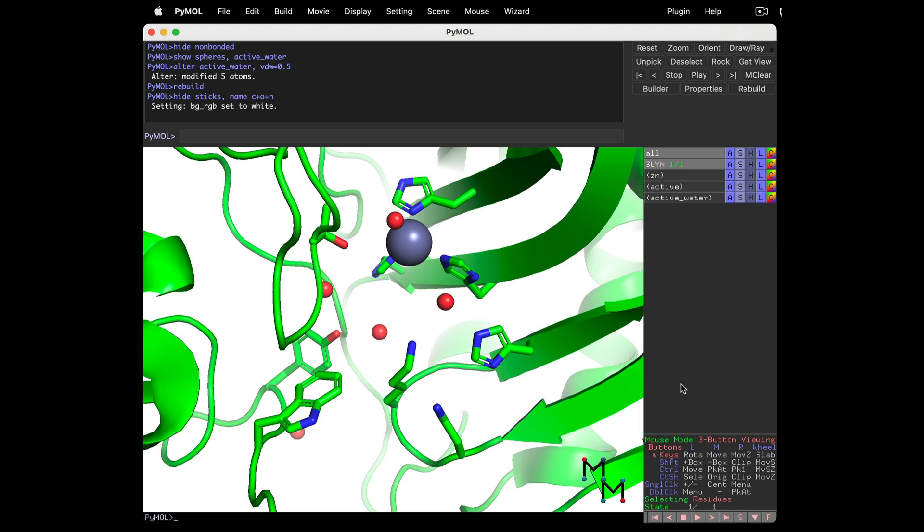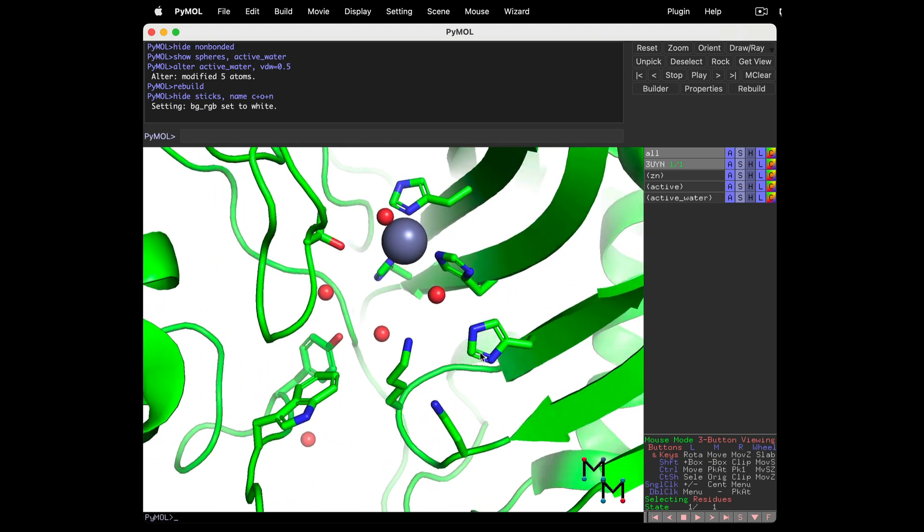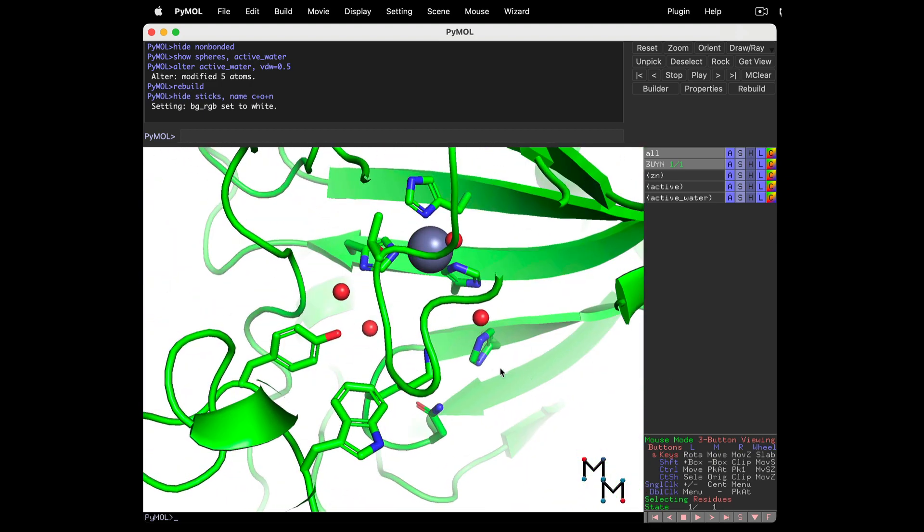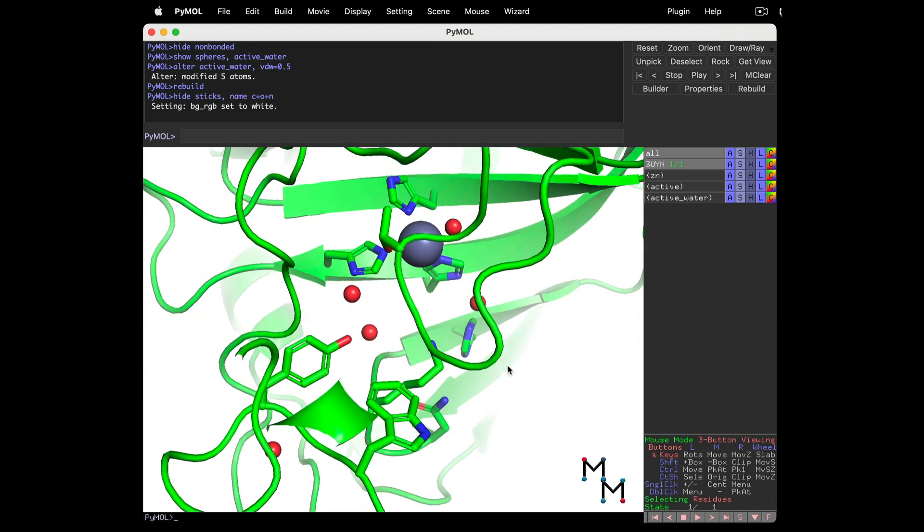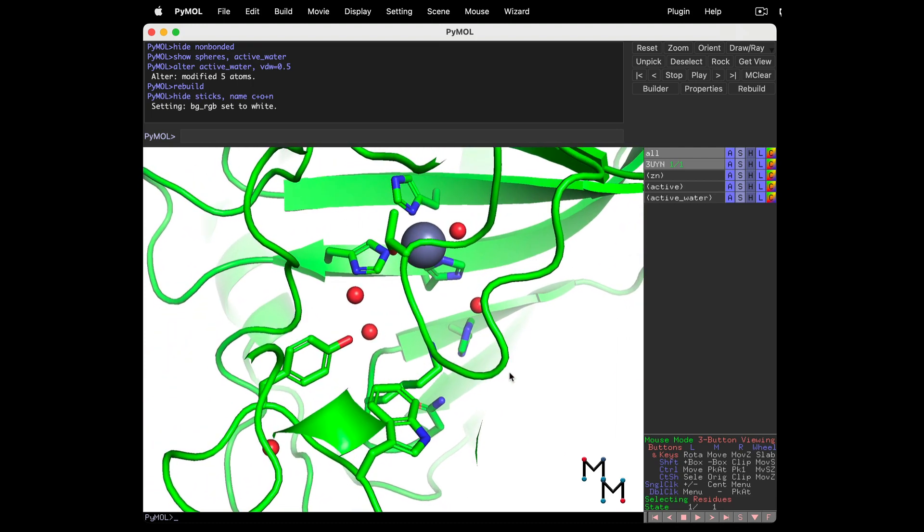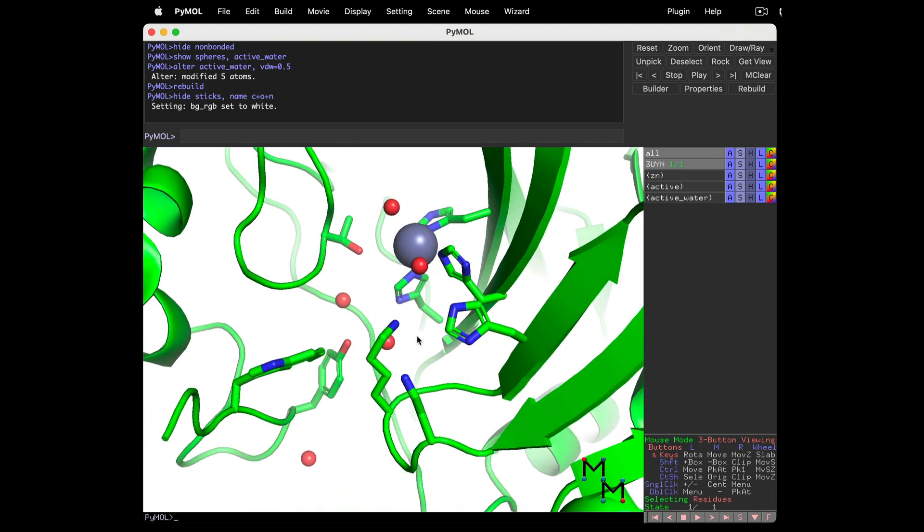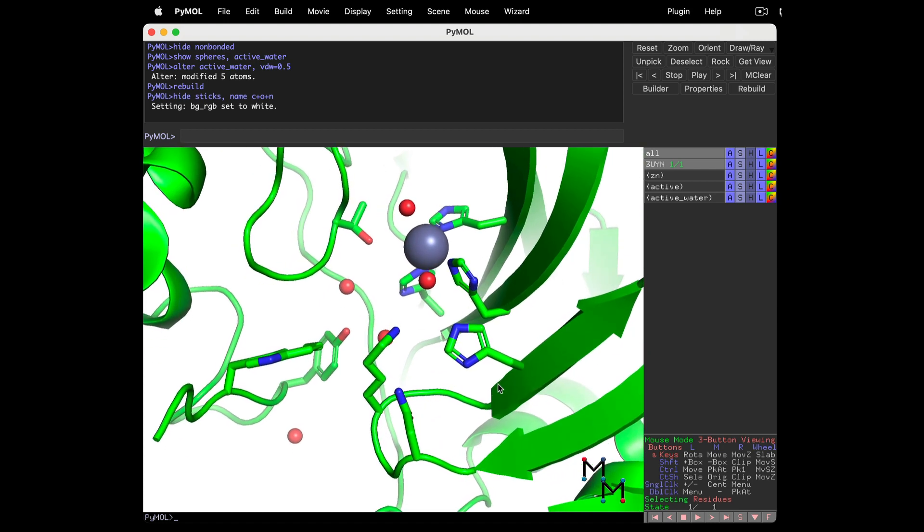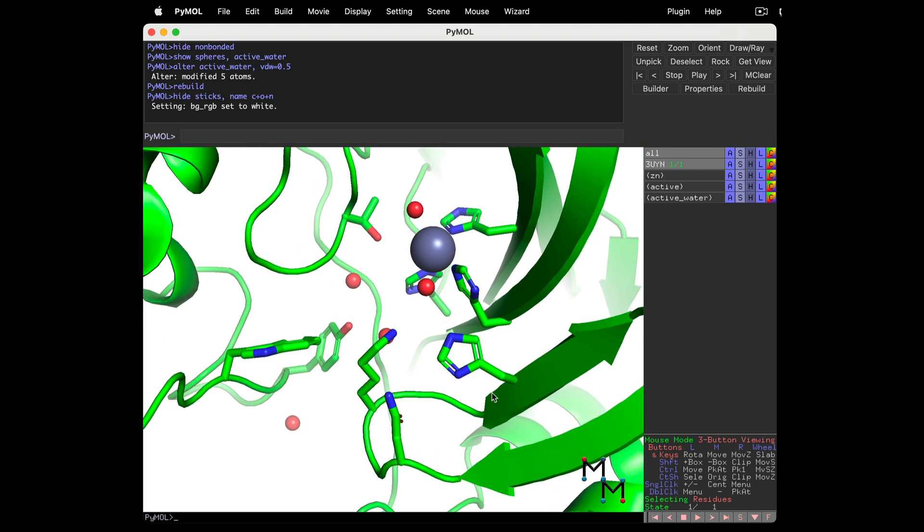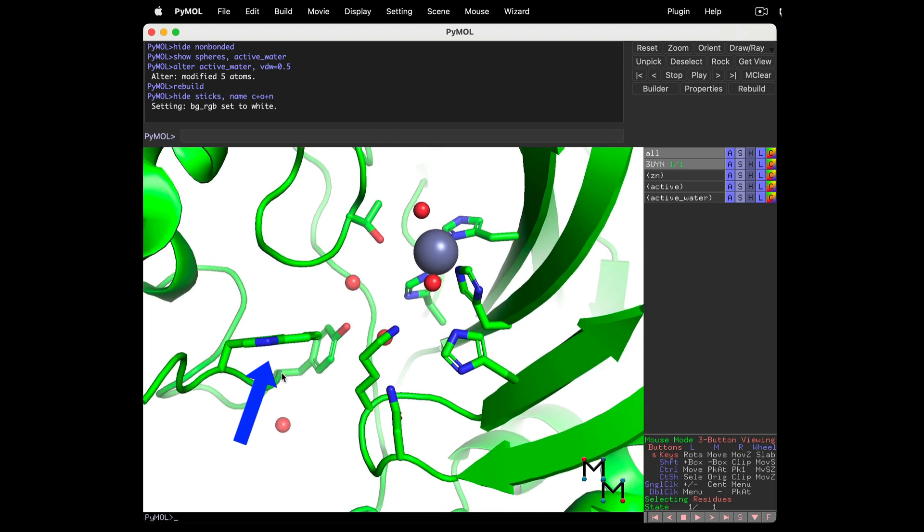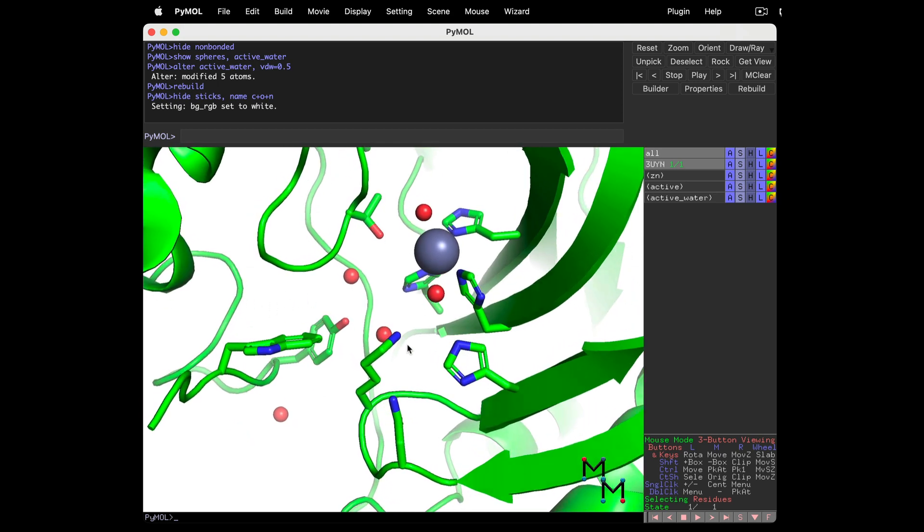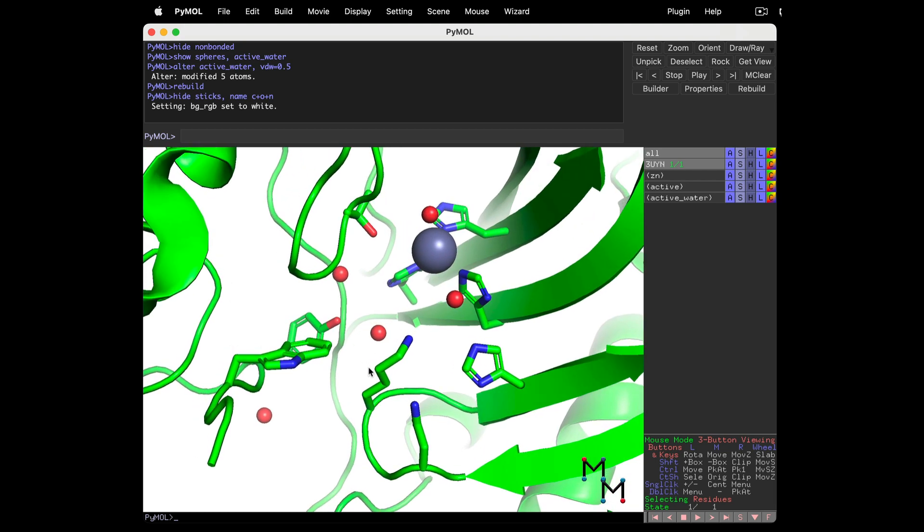This next part is tricky. Reposition the image and try to show each and every active site sidechain clearly. We don't want any hidden behind anything else, and we want to avoid an edge-on view, like how we can't see this tryptophan sidechain here clearly.